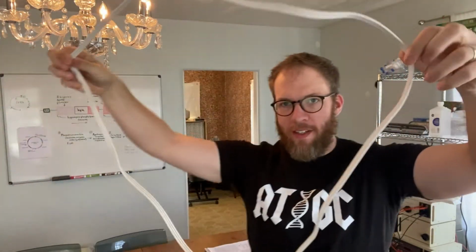To illustrate this idea of plasmids, what I have in my hand is a typical extension cord, and I'm going to connect it here so that this cord is connected into a big circle. You might go, well, it's not really a perfect circle. Well, keep that in mind, because there are things called plasmid maps, which are just illustrated guides to tell you what a plasmid does and lay it out, and we'll come back to that. Often plasmids are presented as perfect circular things. In reality, they probably look a lot like this, and they're probably coiled.